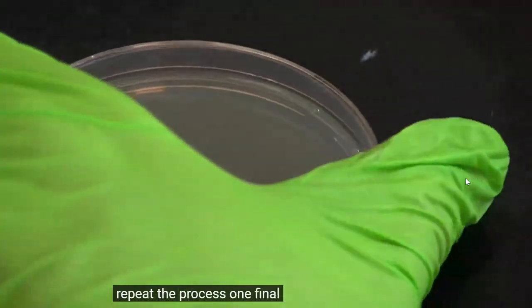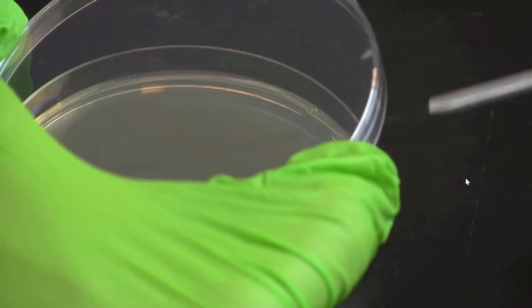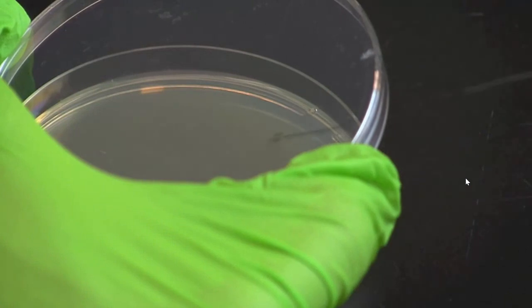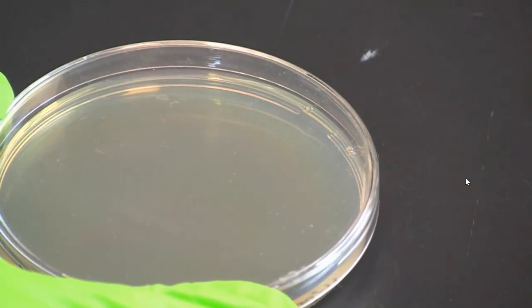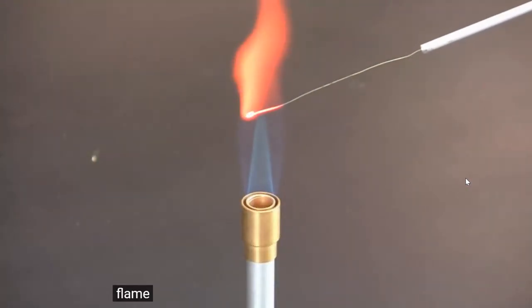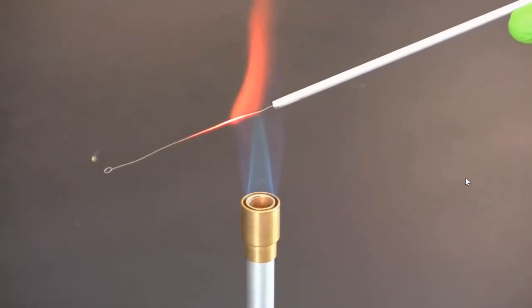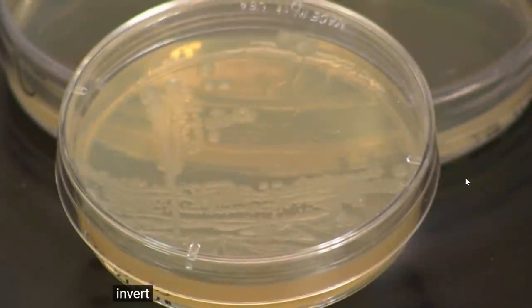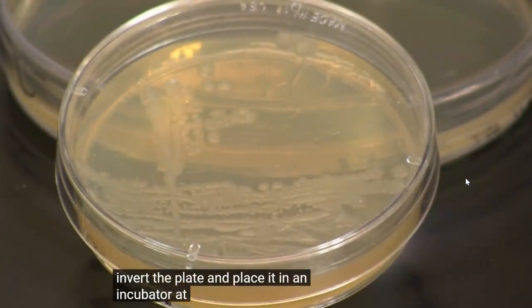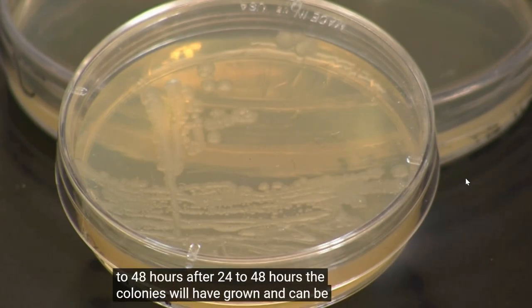Repeat the process one final time in the fourth quadrant. So into the previous streak and then stay out of it. Flame the loop after completing the streak plating. Invert the plate and place it in an incubator at 37 degrees Celsius for 24 to 48 hours. After 24 to 48 hours, the colonies will have grown and can be examined.